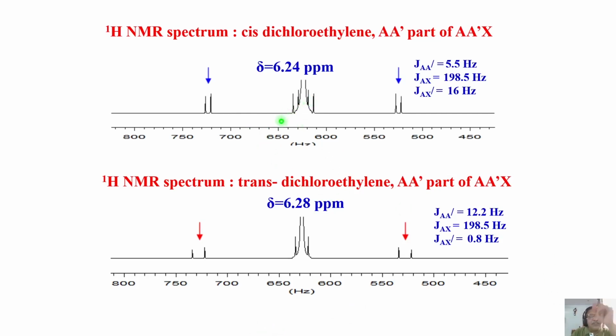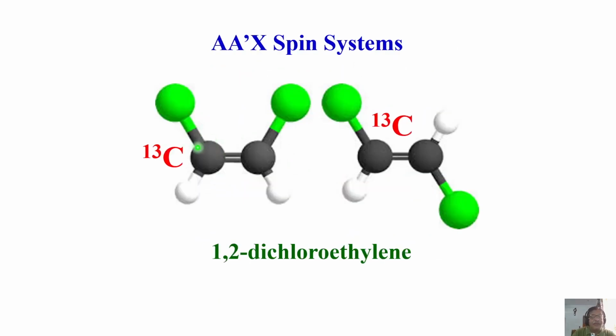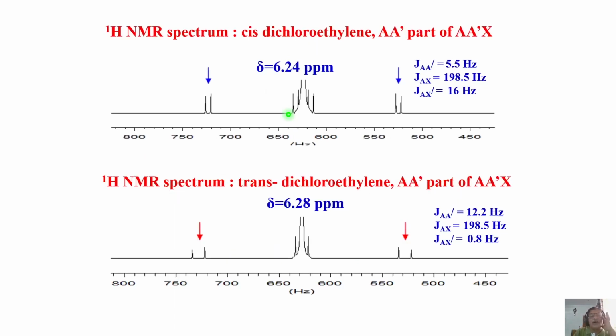Or go to the carbon-13 spectrum where all these couplings, because your symmetry is broken, can be measured. You understand? So in this case, for example, I go to the carbon-13 spectrum here. Then I get a large doublet because of this, and each of this doublet will be split into another doublet because of this. It's a very simple weakly coupled case. So carbon-13 will give 4 lines. So you can measure the separate couplings from carbon-13, or if you measure from the proton, you get this coupling also. Very easily you can measure all these couplings.